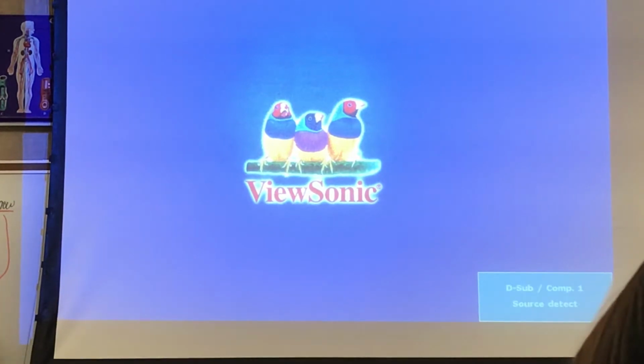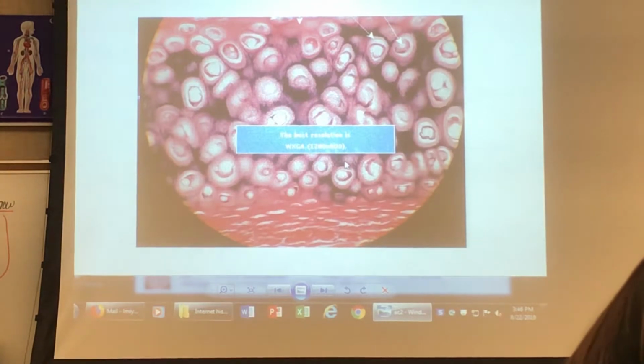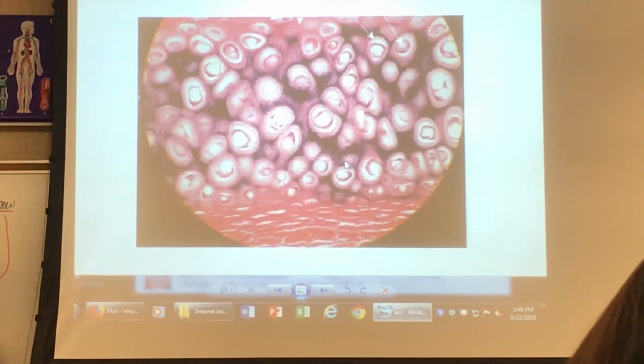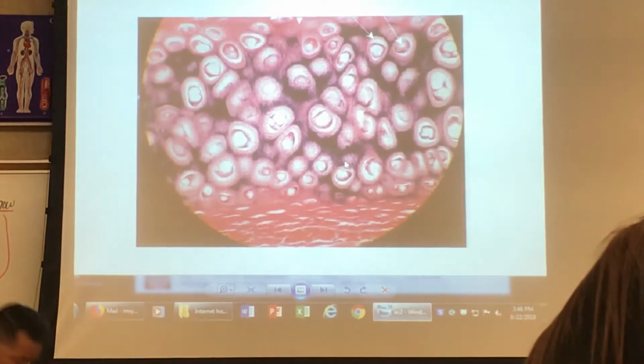Do you see a basement membrane and a free surface? No. Do you see cells separated by stuff? Tissue type number 2. Do you see lacunae? Yes. It's not in the cut tree trunk, is it? No. You see black? Yes. What is it? Elastic cartilage. So you see black in between the lacunae, elastic cartilage.